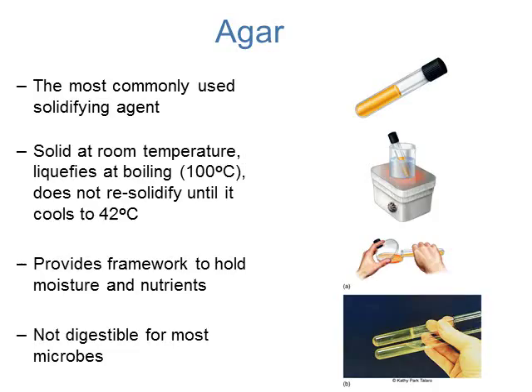The agar does not provide any nutrients. It just provides a framework where we can hold moisture and hold nutrients. The agar itself is not actually used by the microorganism. You have to add some type of food or nutrients to the agar.